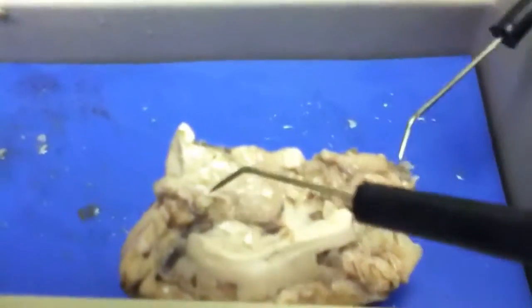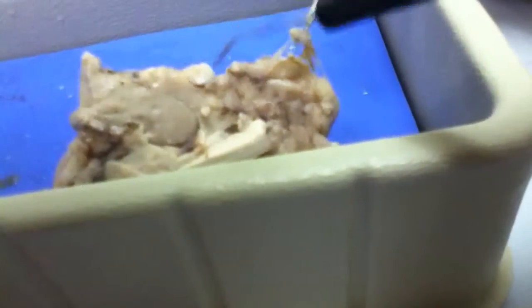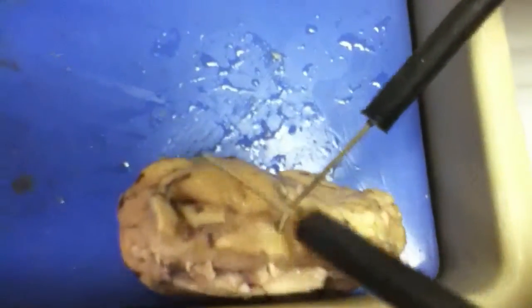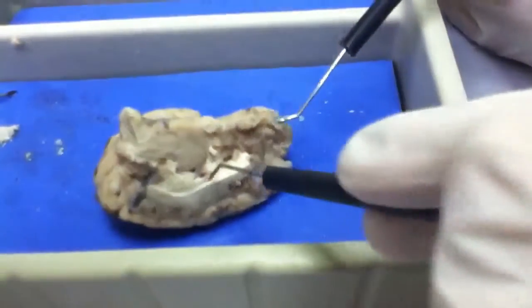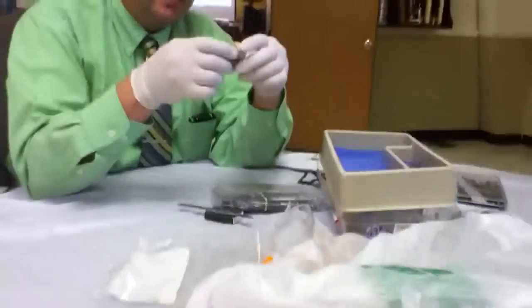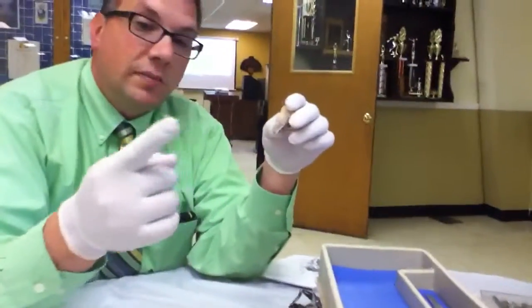On the front you see the olfactory bulb. That's where the eye is connected — actually, that's the optic nerve. On the bottom you see the hypothalamus and the hypophysis — that's this big bubble on the bottom. The medulla is toward the back. Remember, the medulla oblongata is where all the nerves come together in the middle of the spinal cord on the bottom. This doesn't have a spinal cord on it.